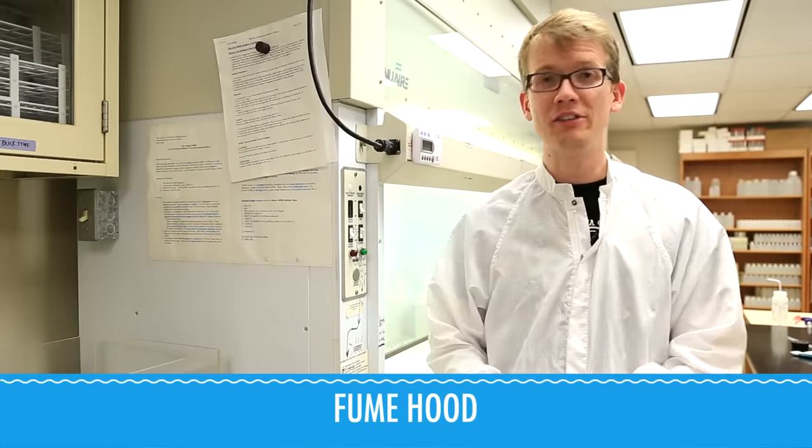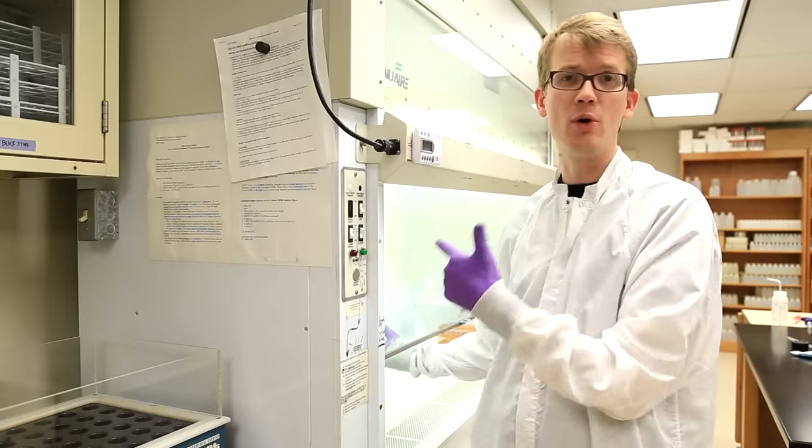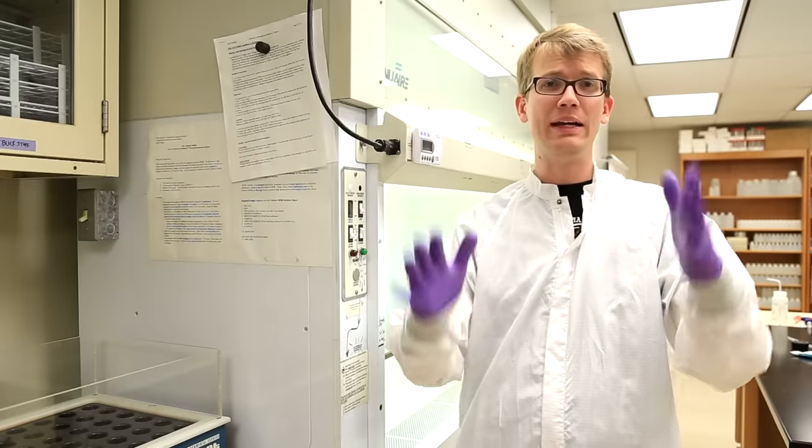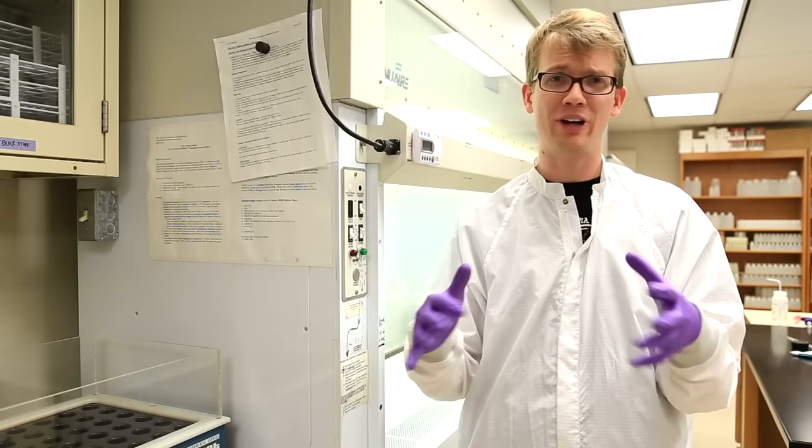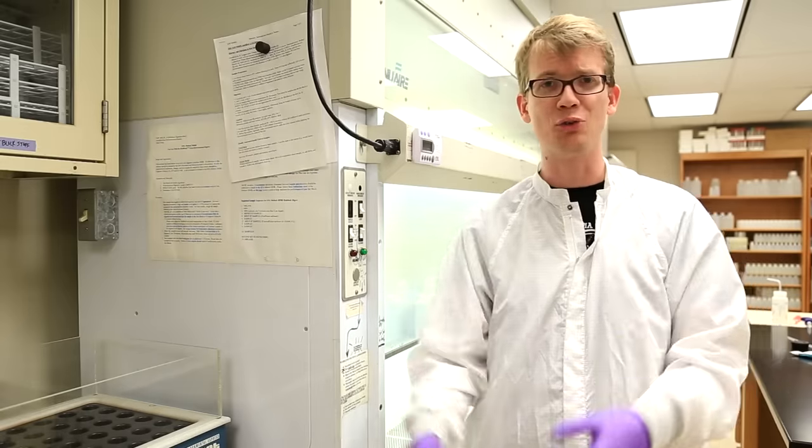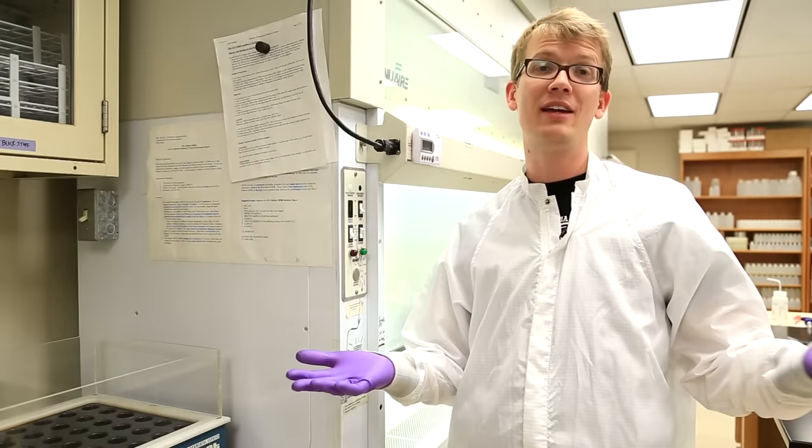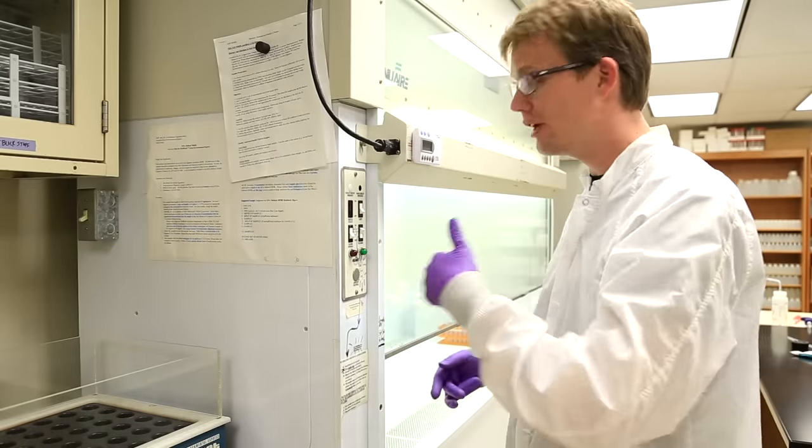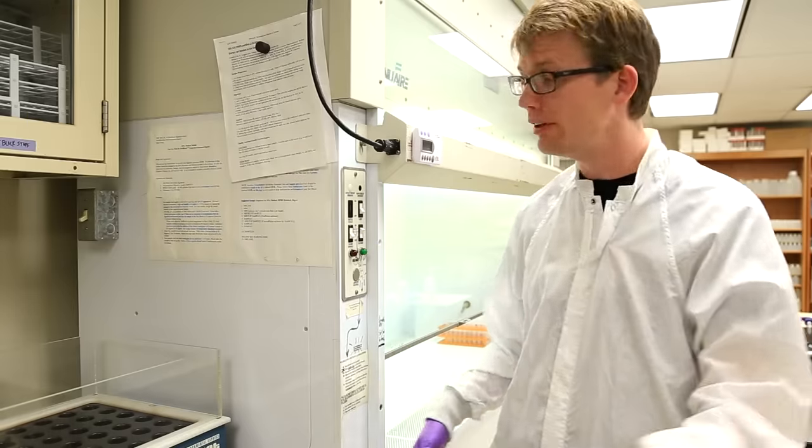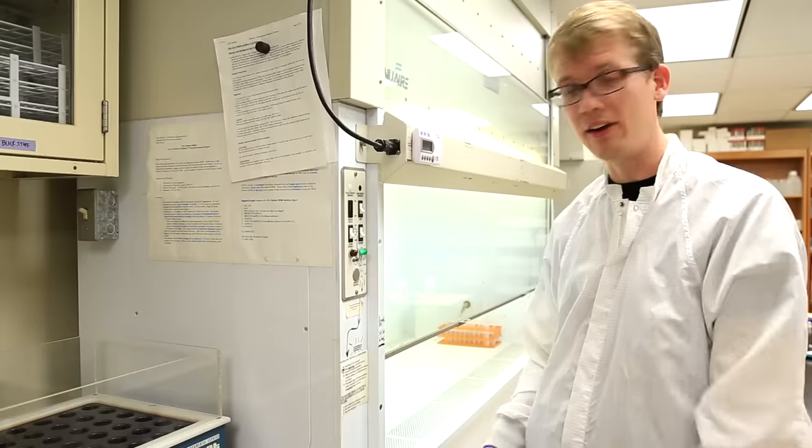This baby here is a fume hood. It sucks all the air in there out so you don't have to breathe whatever's going on in there. It's also why it's impossible to keep chemistry labs at the proper temperature because the AC units and heating units are constantly pumping in controlled air, and these are constantly sucking it out. So if you're doing some chemistry that might contain some noxious fumes, that goes on in here. And if you want it to work properly, first you've got to turn it on. That's the vent. That's the blower. Now it is sucking air.